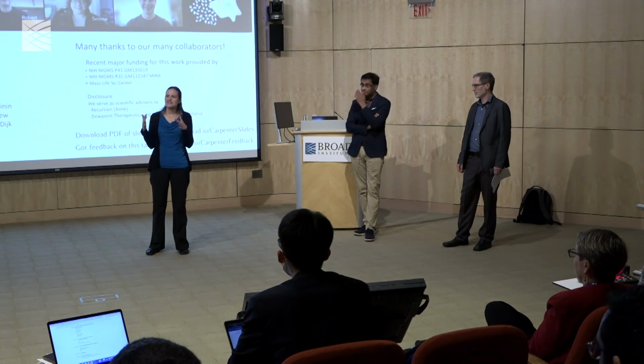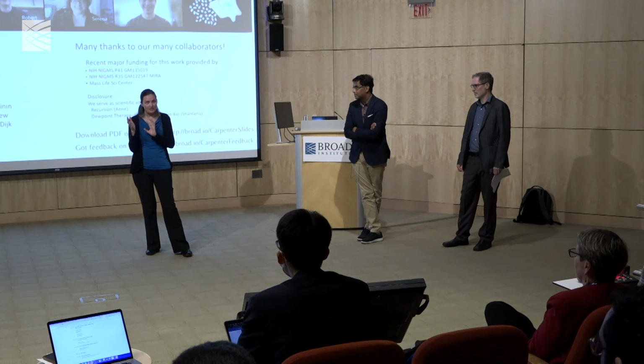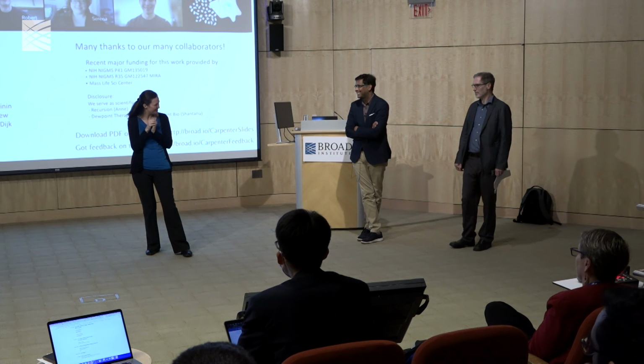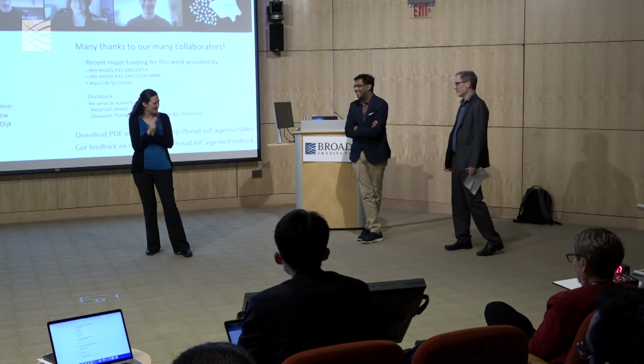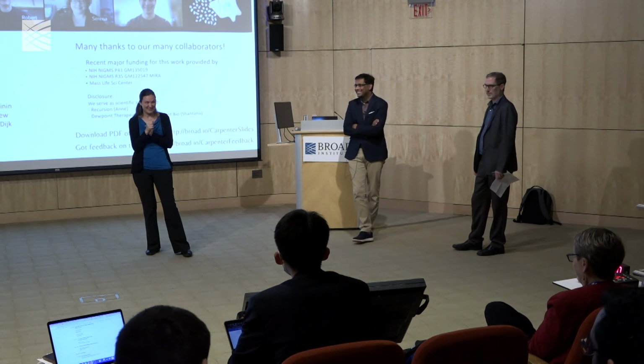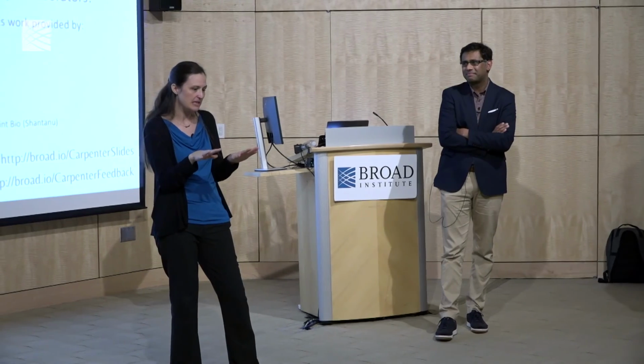Oh, well, there's certainly, roughly 50% of the time there's no impact on the cell that's detectable to us at all. But then if you're asking, when there is a detectable change, what proportion of the time is it detectable to our eyes versus the computer? I'm not sure I have a good percentage of that. Biologists are very good at making up stories. So a lot of times we'll look at images and say, okay, the computer tells me that these are different, and now I'm staring at them and, yeah, I see a difference.